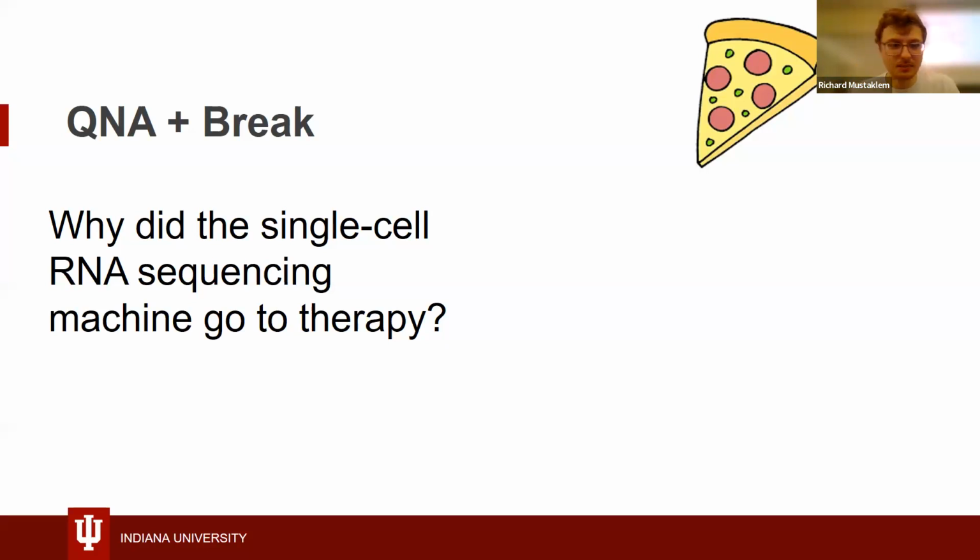Both of my mentors are a perfect example. I have one mentor who's a postdoc, and he likes to integrate all at the very start. And then I have my PhD mentor, and he likes to integrate after quality control is done. They have their own disagreements with each other about it. There's no correct way. What I personally do is integrate all at the start. So you merge all of your data, and then you do quality control.